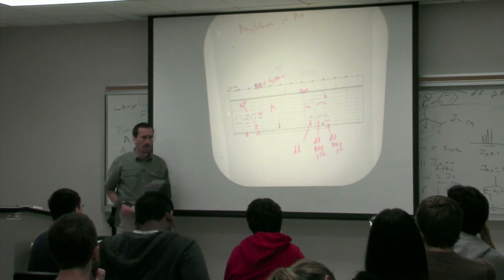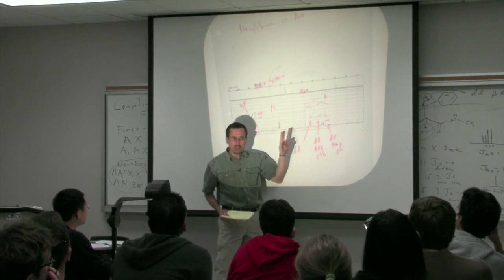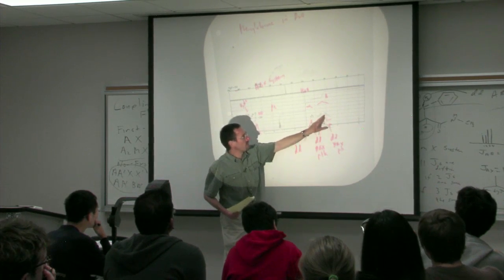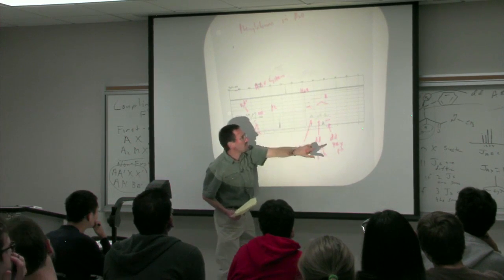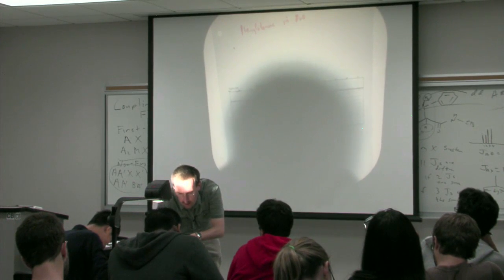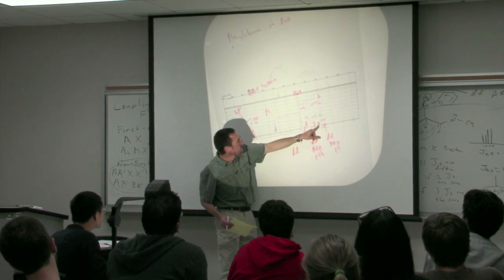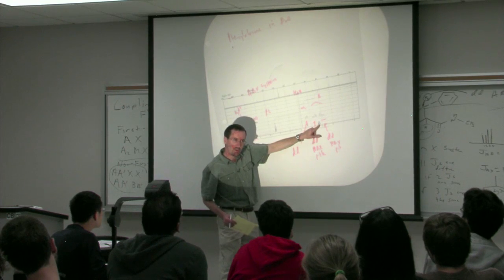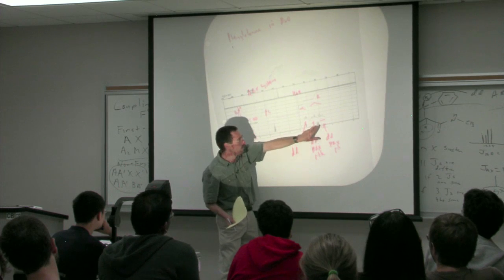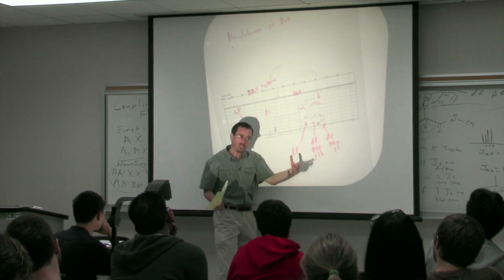Thoughts or questions? With the alpha proton, if it's a doublet of doublets, shouldn't it be leaning a lot more? Great question. You notice these guys are really tenting into each other, and this one is just barely tenting in. Now look, this is a 300 megahertz spectrum. So the distance between these two looks like it's about two tenths of a ppm. So the distance between these two is about 60 hertz, because it's 300 megahertz, so it's 300 hertz per ppm. And the J value is about 14 hertz. So that's a case where delta nu over J is about 4 or 5.